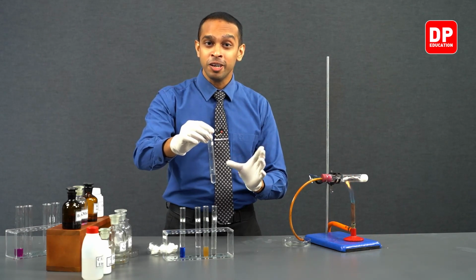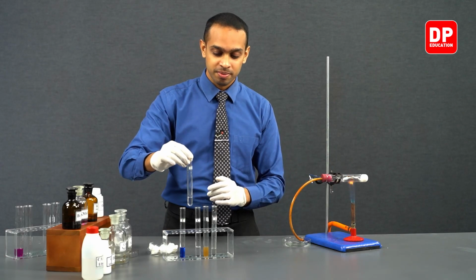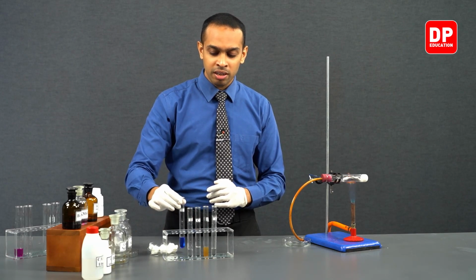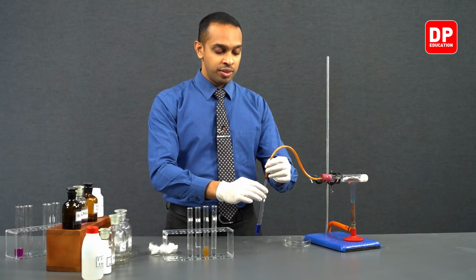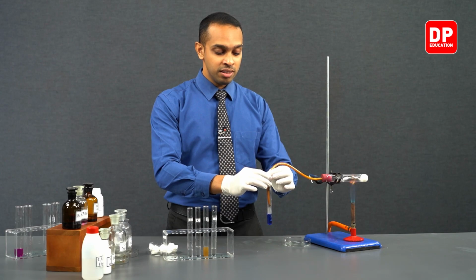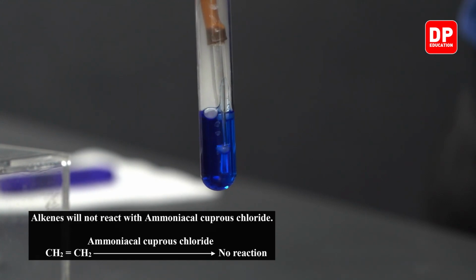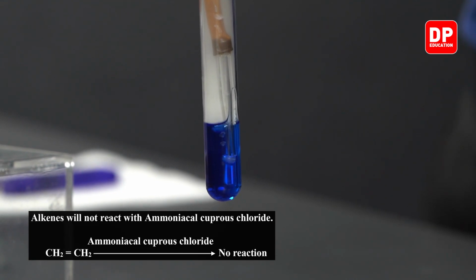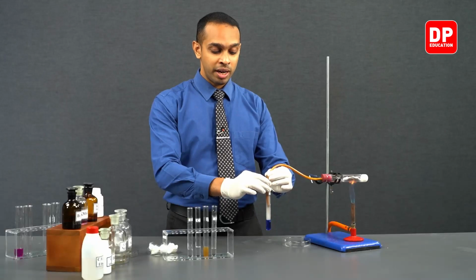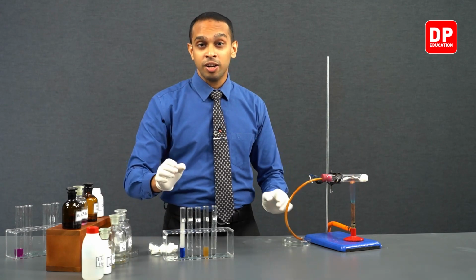However, we can't say the same for ethyne gas. We will observe that in the next part of this experiment. What about ammoniacal cuprous chloride? We'll send ethene gas through ammoniacal cuprous chloride. As you can see, when we send ethene gas through ammoniacal cuprous chloride, we do not observe any further reaction. The color of the cuprous chloride did not change.